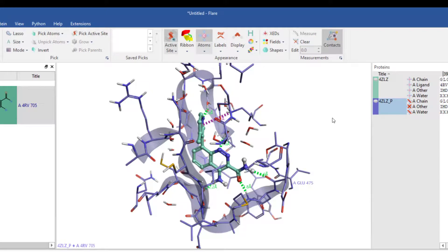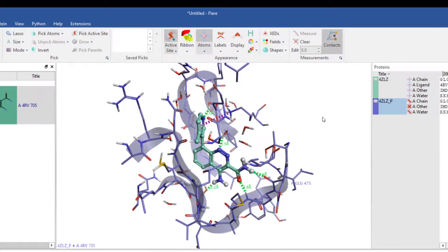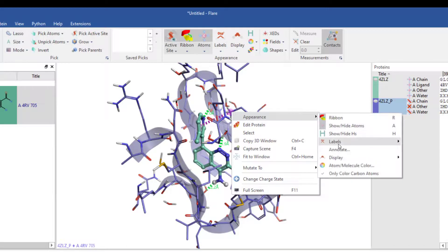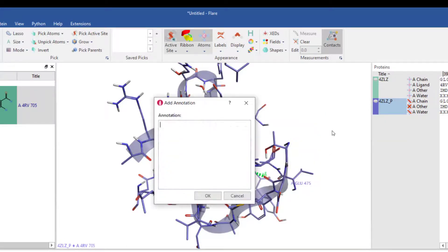Alternatively, I can annotate moieties with freeform text by selecting them, right clicking, selecting the annotate option and typing into the resultant window.